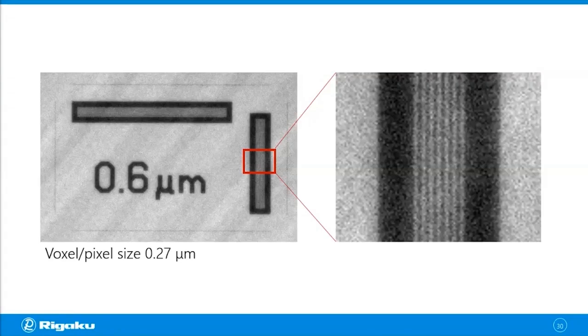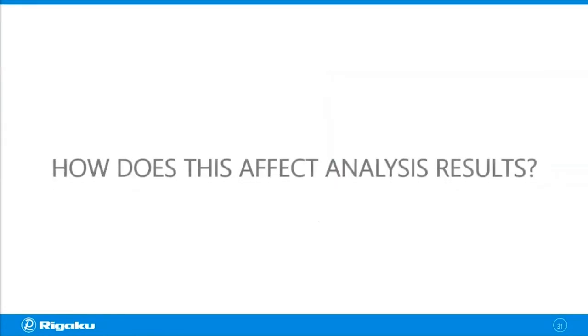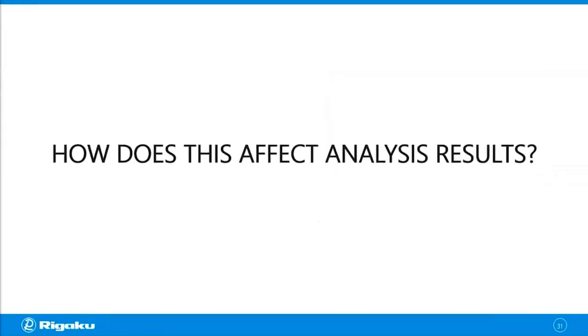And it's important to achieve high resolution and make sure that you have the resolution you need to get high quality images, or to make your images look better or pretty. But it is also important for the quantitative analysis. So how does the resolution affect analysis results?